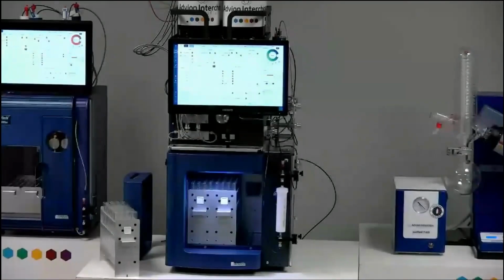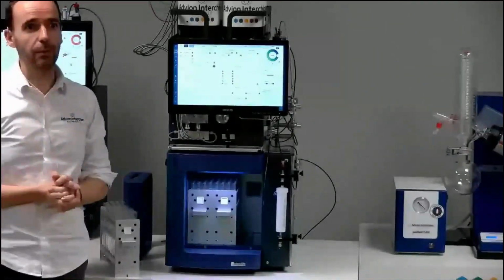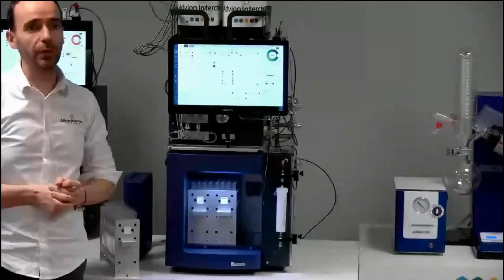Can you do stack injection? No, it's not possible for the moment. We will have to improve our system to do that.